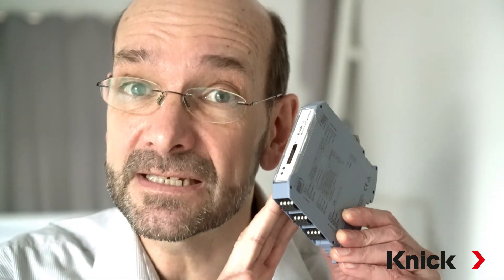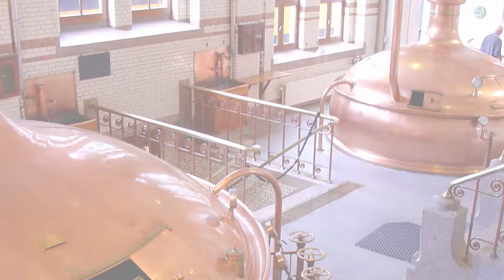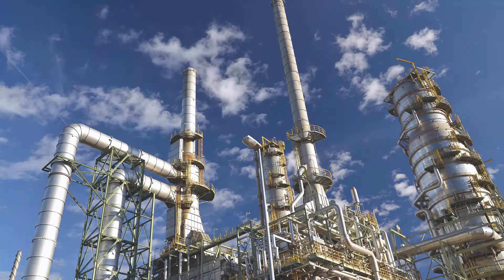Thanks to their compact housing, MemoRail Modbus Transmitters can be easily installed on DIN rails and in control cabinets. The compact transmitters are suitable for all industries such as pharmaceutical, food and beverage, and chemical industry.